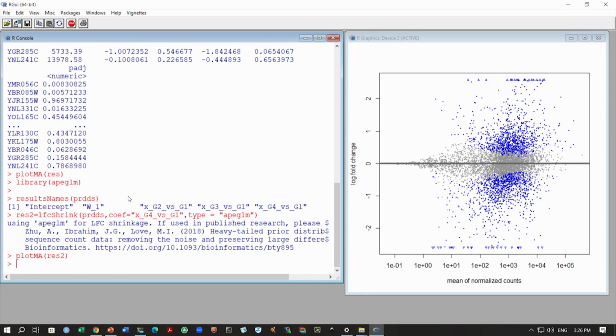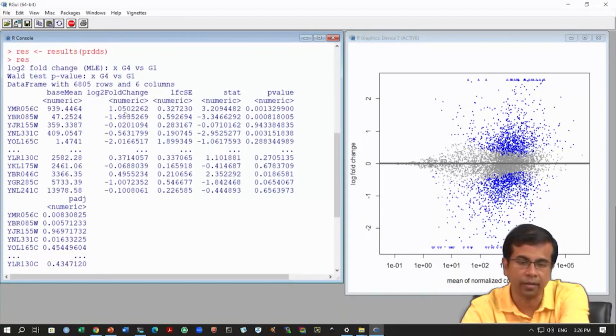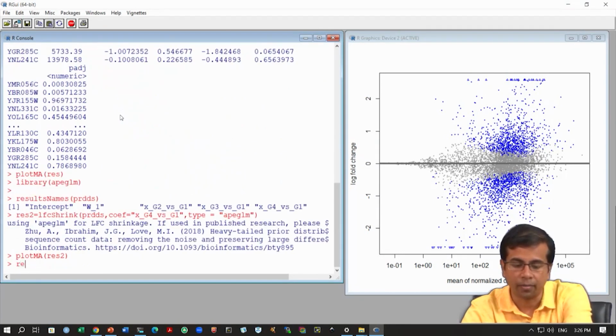Okay. So, one thing you probably have to do now is actually compare how this goes, going back to the earlier DESeq2 analysis and see how these results look. Okay. There would be some differences. They look very similar, but there would be some differences, especially when you export the data, and also if you can look at this data here, you will see there is probably some difference. Okay. So, I can plot this.